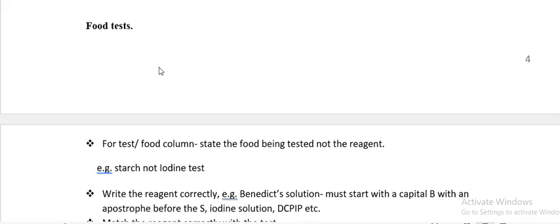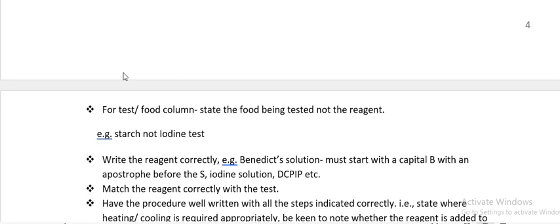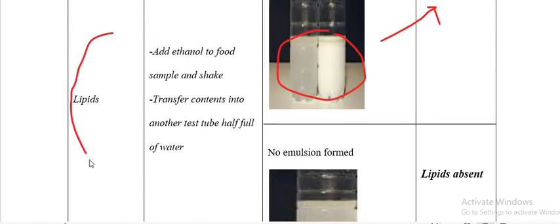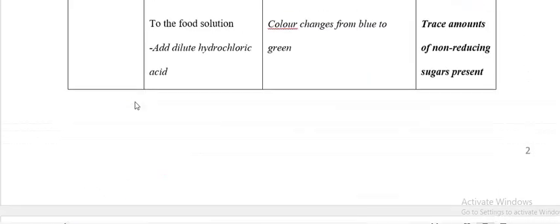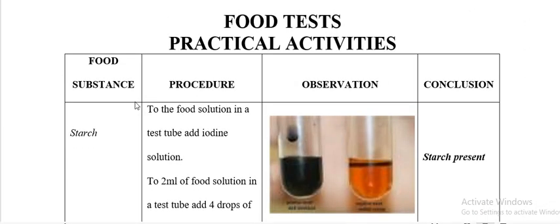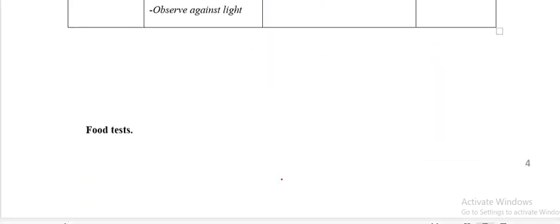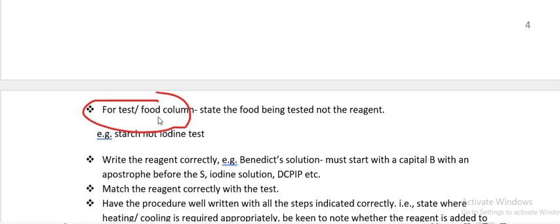Now let's talk about common mistakes when handling the food test. The food column must contain the food substance — for example, if testing starch and reducing sugars, you name the food being tested, not the reagent. Say 'starch,' not 'iodine test.' Write the reagent correctly; Benedict's solution should have a capital B and apostrophe between T and S.